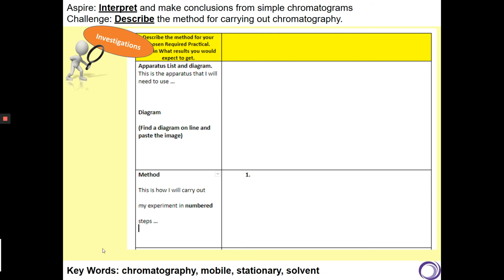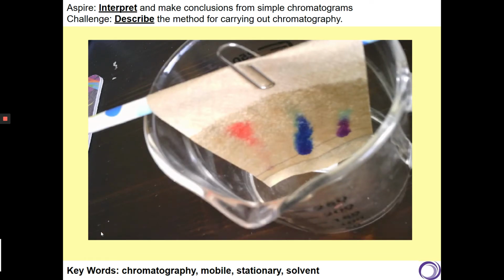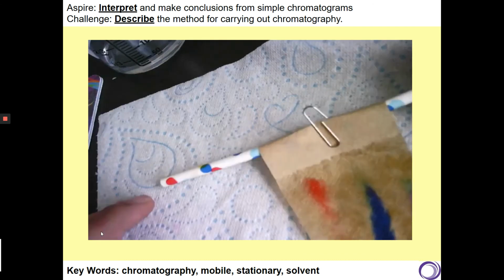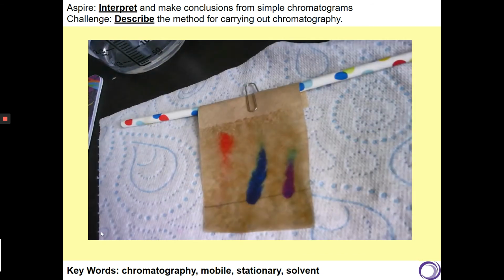Okay, let's go back to the one that we started earlier. Here you can see that the solvent has got quite close to the top of the paper now. So we take it out and we put it down to dry. At this point, we should also make a line with pencil next to where the solvent finished.